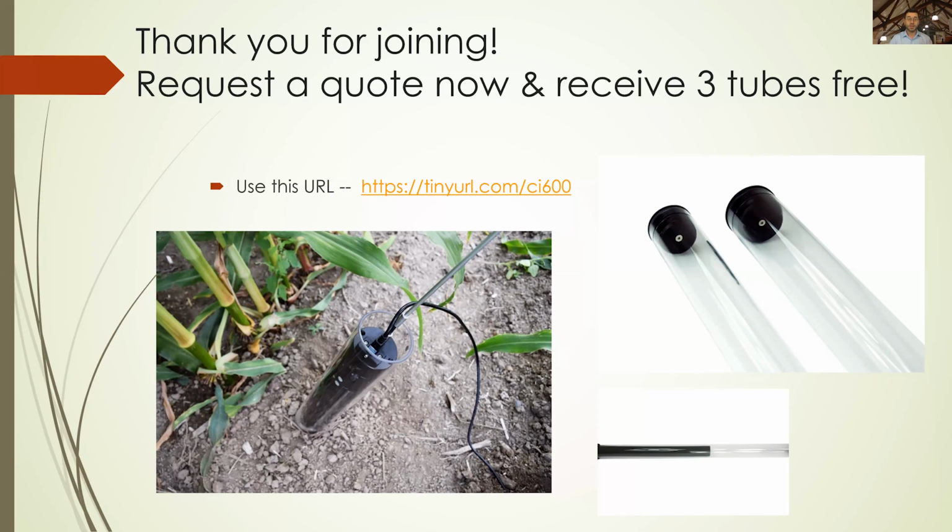The next question, is it possible to measure cassava roots, especially necrotic tissues in cassava roots? Personally, I know there's research already been done using the 600 on cassava roots. However, I don't know if it's been done for necrotic tissues. I would imagine, since it has been done for necrotic tissues of other plant species, unless there is some kind of variable I'm not aware of, it should be useful for that use.